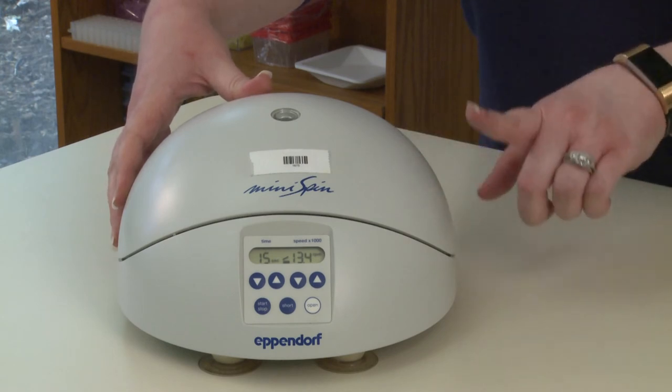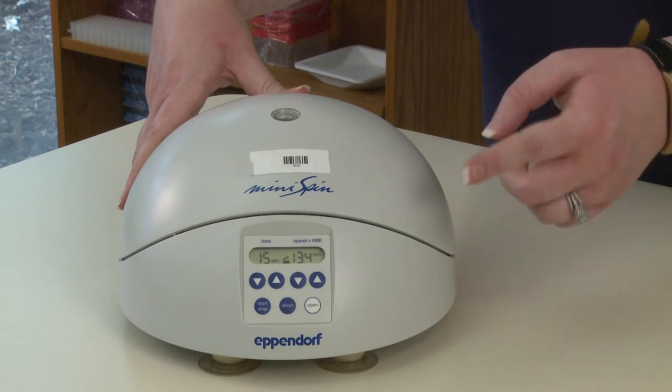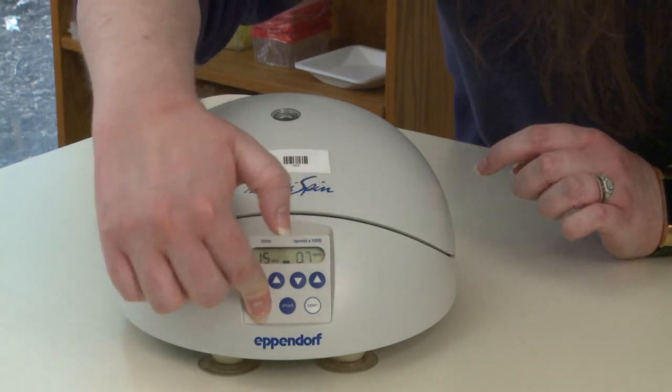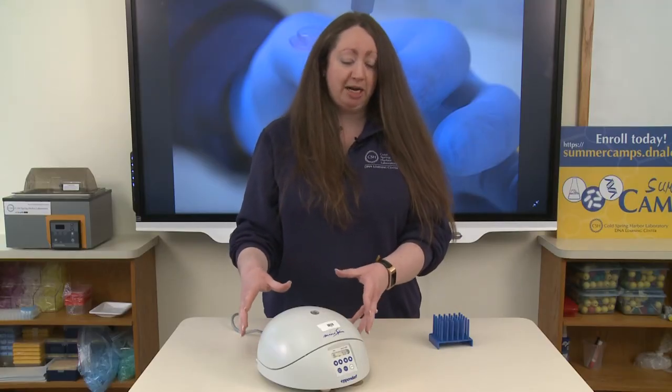Make sure that if your centrifuging protocol is in g's and not RPMs that you make that calculation so that you're spinning in RPMs instead of g's. To start, press the start/stop button. You are going to hear the rotor begin to spin. This is when you'll hear that very loud noise if something is unbalanced or you're missing that small inner lid. This is going to spin for approximately 15 seconds. When it's finished spinning, the lid will pop up automatically — you do not need to press the open button.